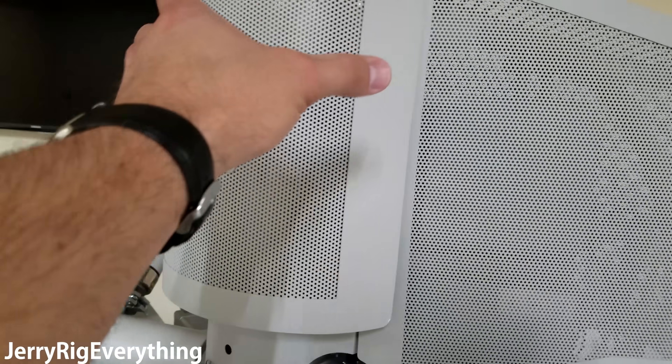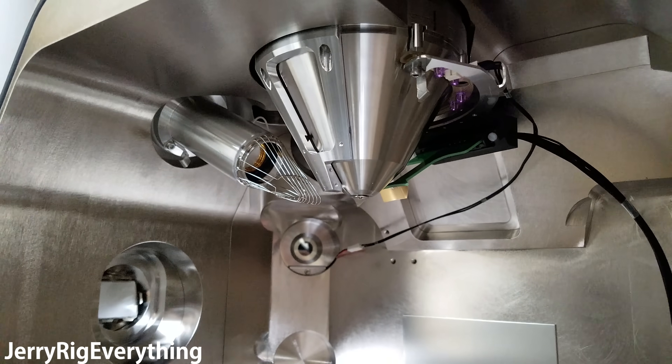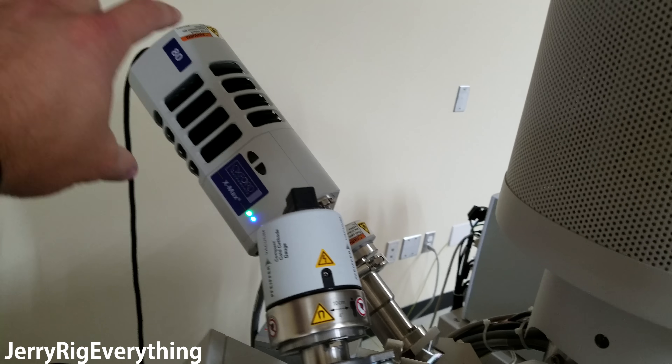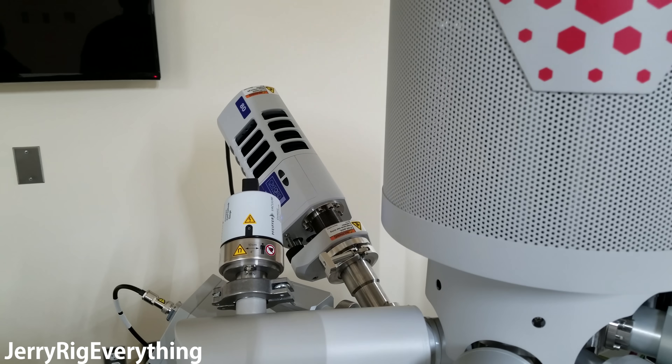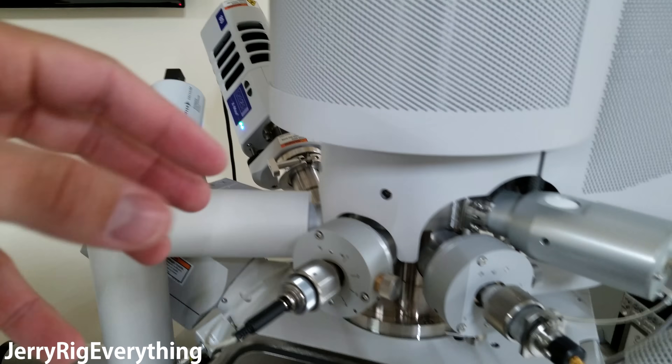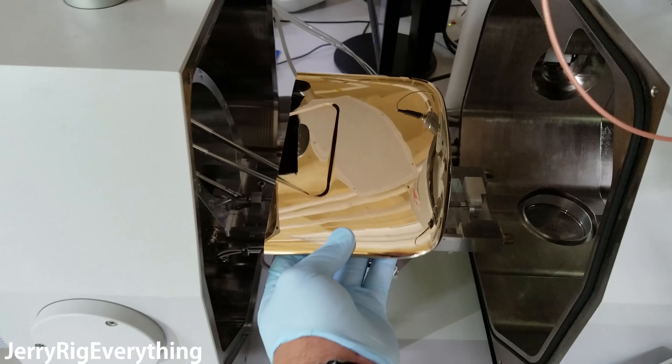Here's the electron microscope. You can see the electron beam comes out of that little silver thing right there. What tells us the makeup of the actual item inside is this part right here — this is the energy dispersive x-ray spectrometry gizmo. That tells us what the play button is actually made up of.